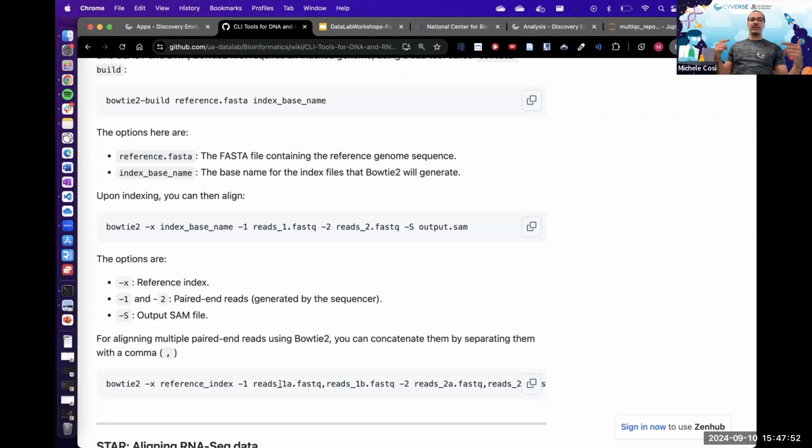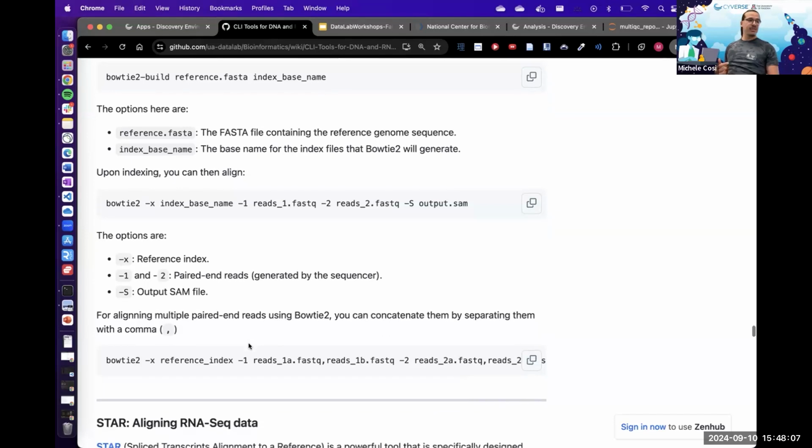Yes, correct. So now we're taking into consideration paired-end reads, and ideally, they create a better alignment, or a more accurate alignment, if you have reads coming from both sides. So for each single sequence that comes out of the sequencer, you have two coming along, but it is extremely rare that you only have read one and read two.